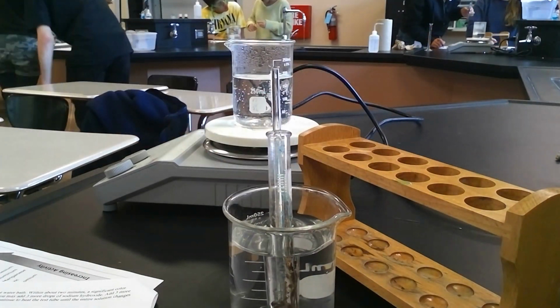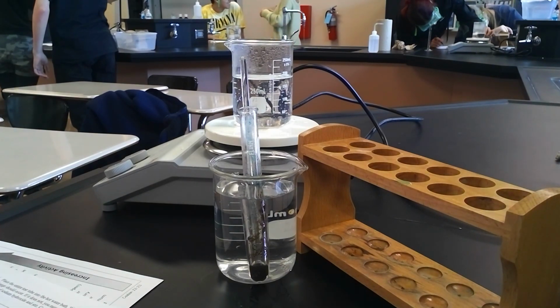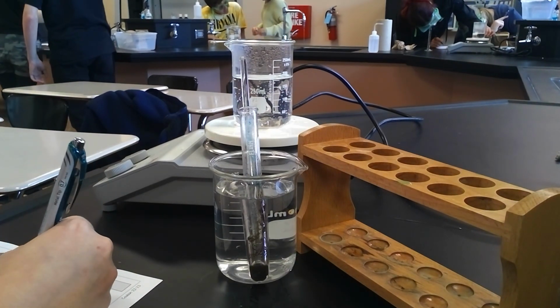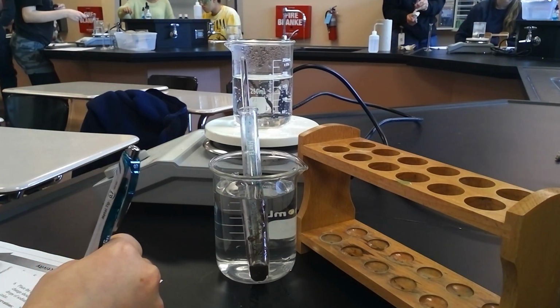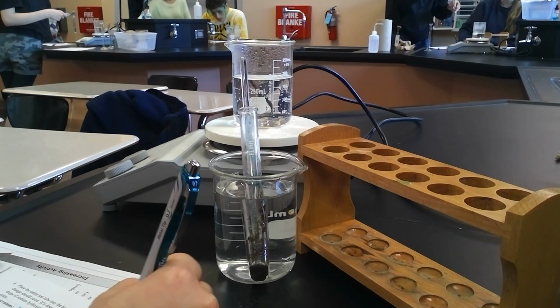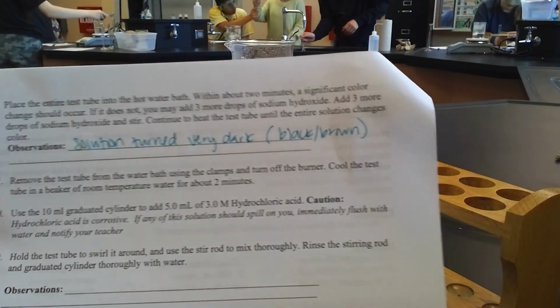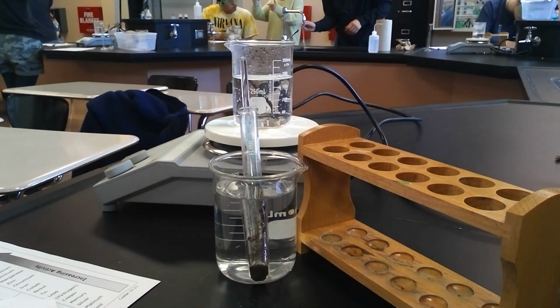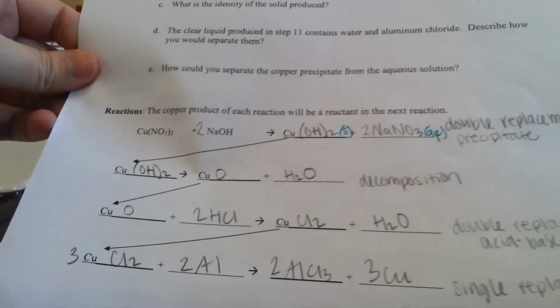Meanwhile, I have a room temperature beaker of water, so I'm going to just toss that in there. We'll keep an eye on it. So the observations are that solution turned very dark. I'm going to say black-brown. I could not tell at first glance if there was a precipitate in there based on the reaction that just took place. So we did heating of copper 2 hydroxide, formed copper 2 oxide, and water.